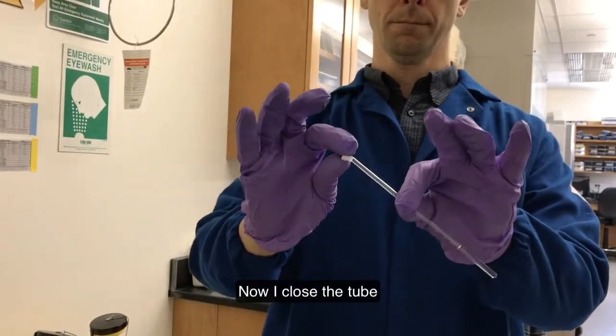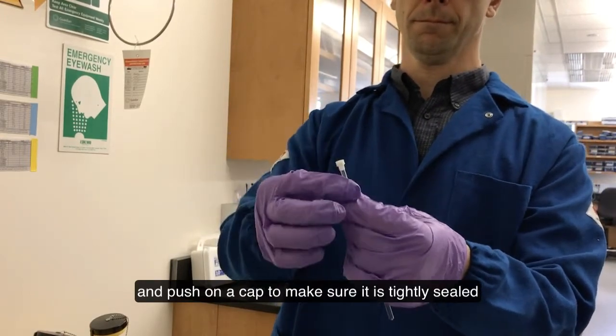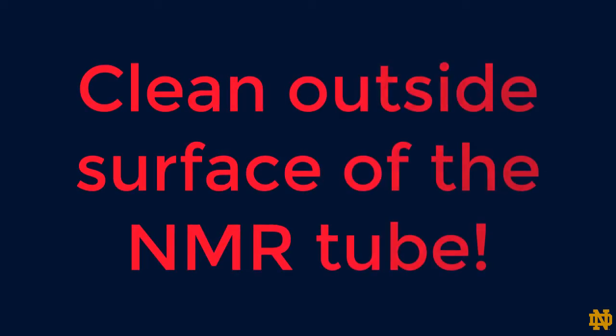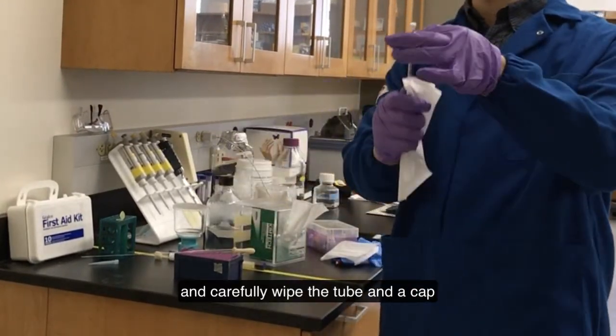Now I close the tube and push on a cap to make sure it is tightly sealed. My next step is very important — I must clean the outside surface of the NMR tube to remove any residue of chemicals. I grab a tissue and carefully wipe the tube and the cap.